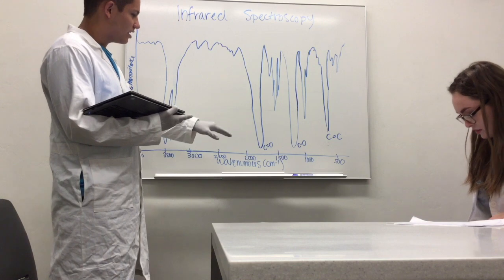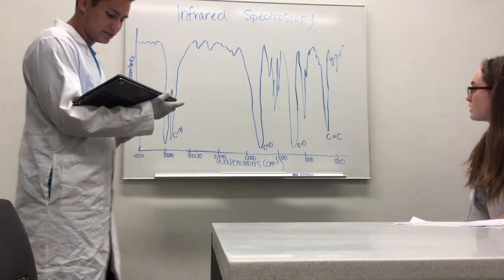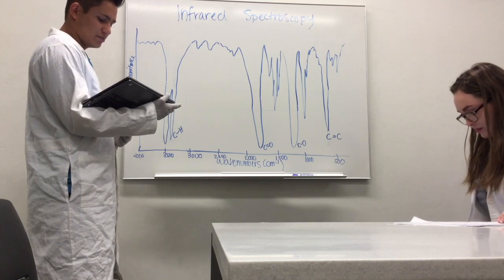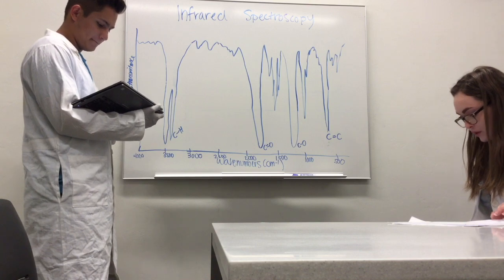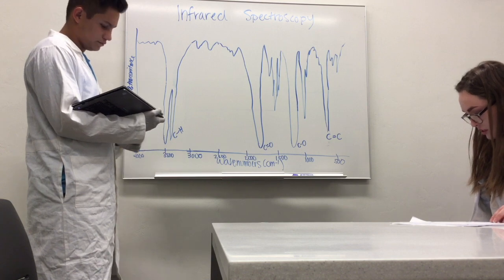Between 1000 and 1500, a C single bonded to oxygen, and 500 to 1,000 wave number represents the C double bond of this carbon. We determined this based off an IR spectrum table that shows bonds present at different wave number or absorbance values. So in conclusion, we know our solution has a carbon-hydrogen bond, carbon-oxygen single and double bonds, and carbon-to-carbon single and double bonds.